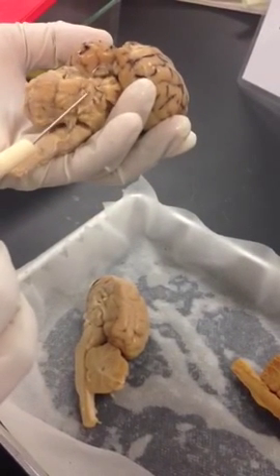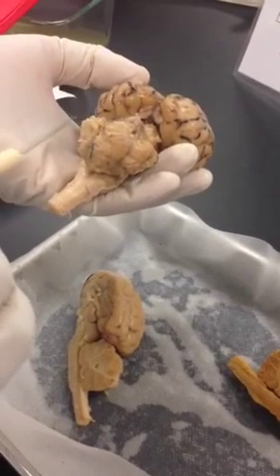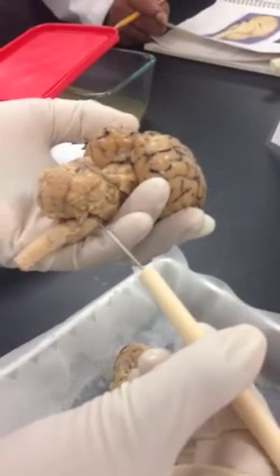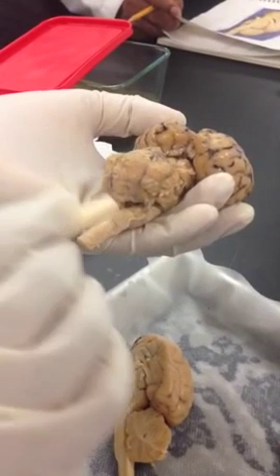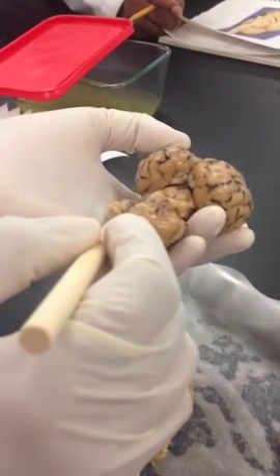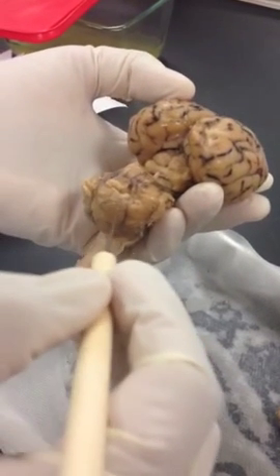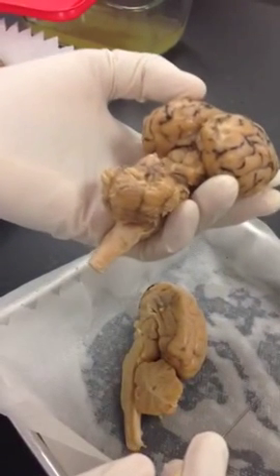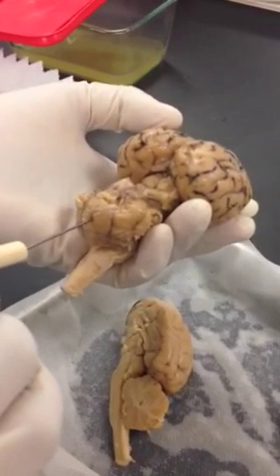Depending on the location, they call it medial or lateral. So the lateral hemisphere of the cerebellum is all the way outside, right? The middle structure you see connecting the two hemispheres, they call it vermis, because if you look carefully, you see a bunch of tiny lines that represent worm-like structures. So they call it vermis, V-E-R-M-I-S. Okay, so that's your vermis.